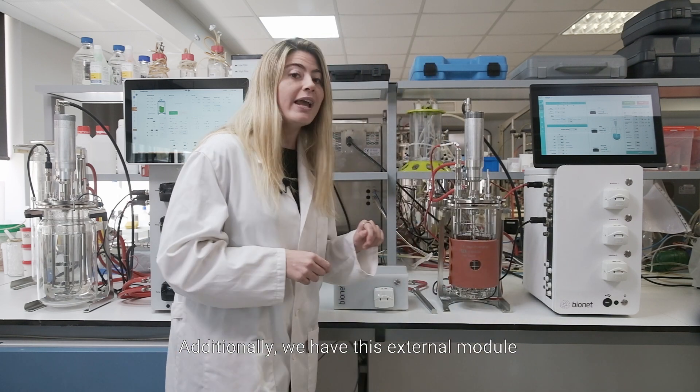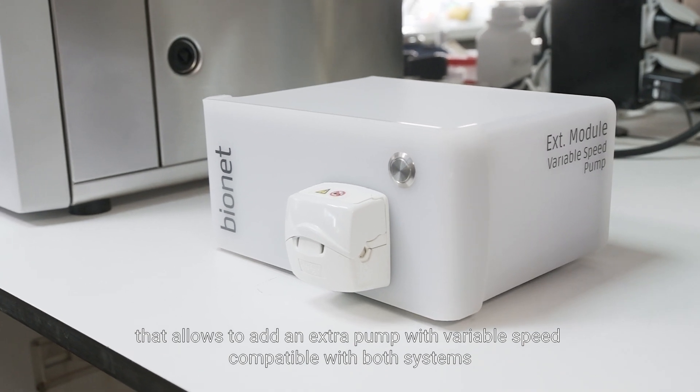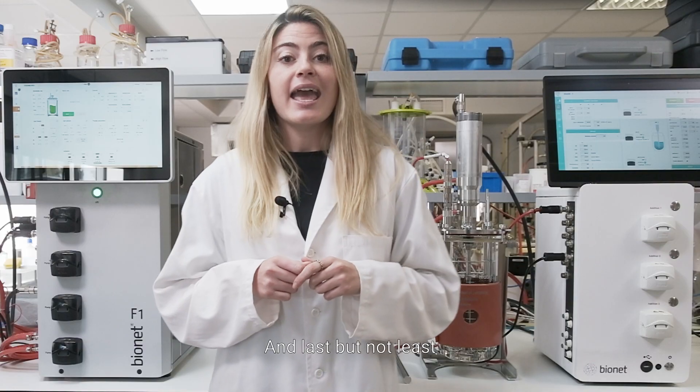Additionally, we have this external module that allows adding an extra pump with variable speed, compatible with both systems.